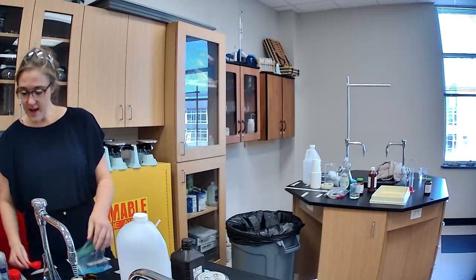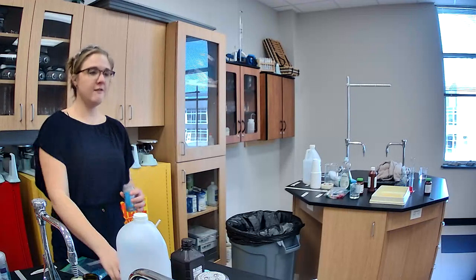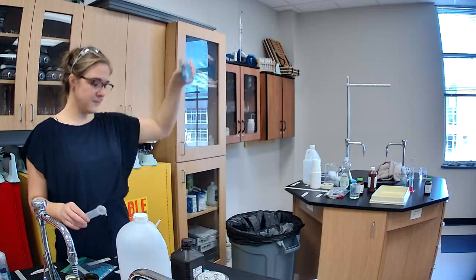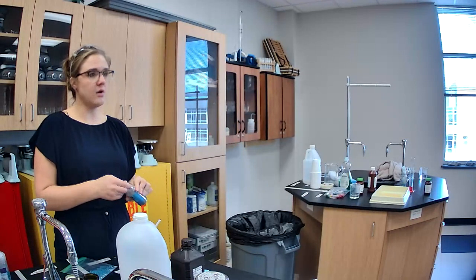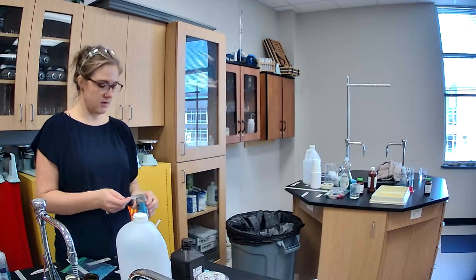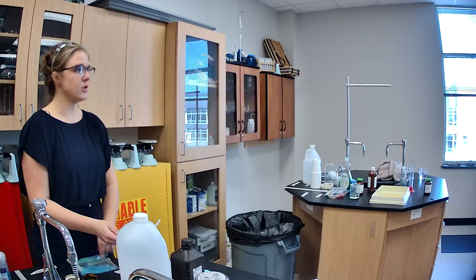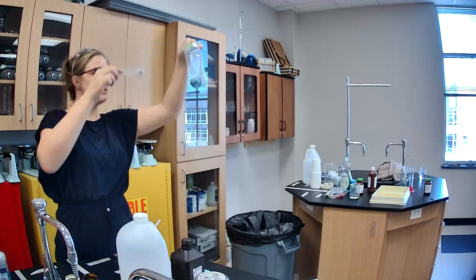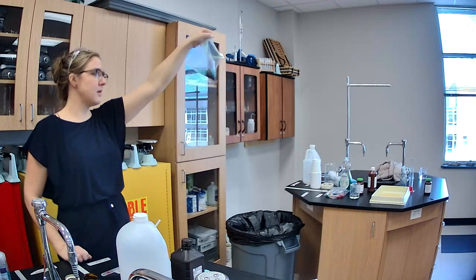Next, we're going to add a teaspoon of what? Iron filings, okay? Really just little tiny shaved pieces of iron. What happens when you combine iron and water? Or metal and water? It rusts. Very good. What color is rust usually? Kind of brownish orangish, right? So, ideally, we should have the rust turn orange as it combines with the water and the beads. But the water is trapped in the beads right now.